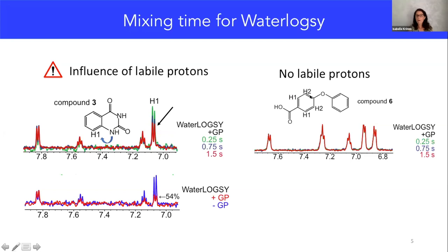And if you compare with another compound on the right here, where you do not have any labile proton, you don't have this issue, because if you compare all the WaterLOGSY data at different mixing times, you always have the same answer, because you don't have this issue with the water exchange with labile protons. So this is something that you have to be careful about.